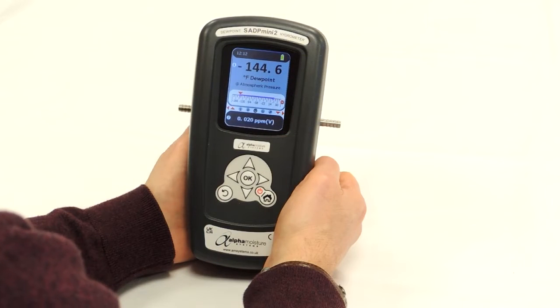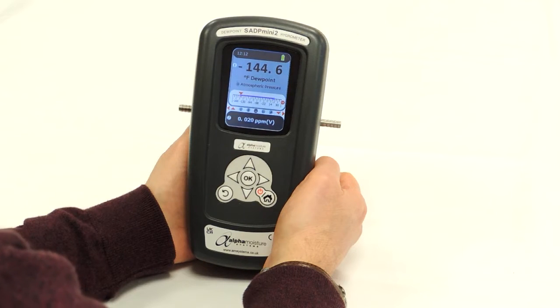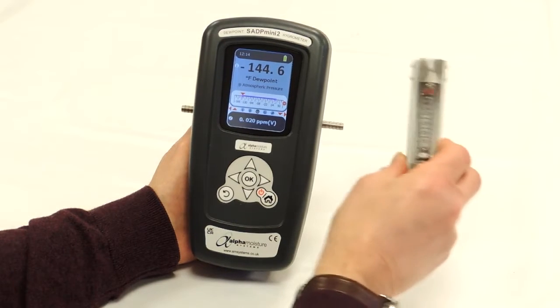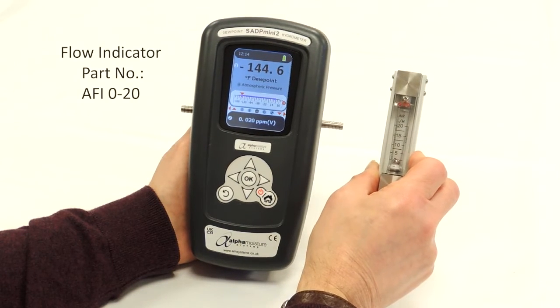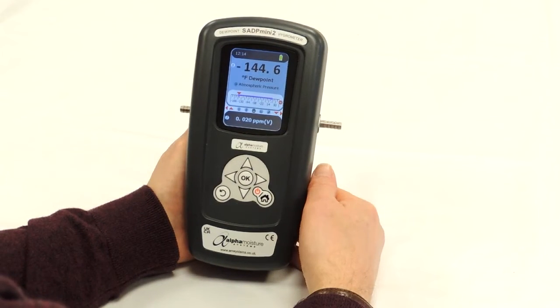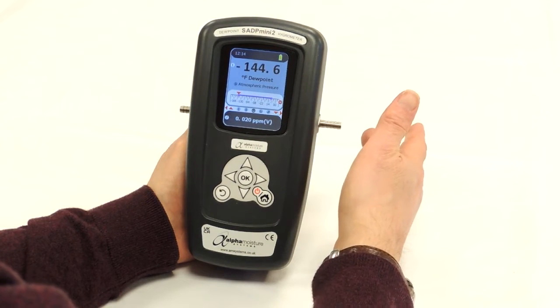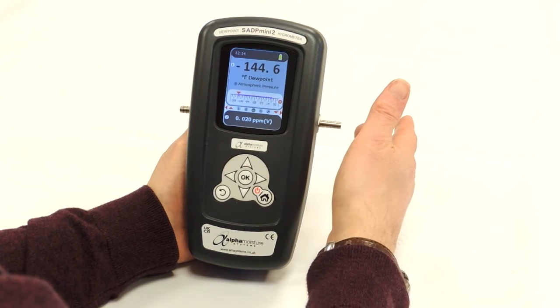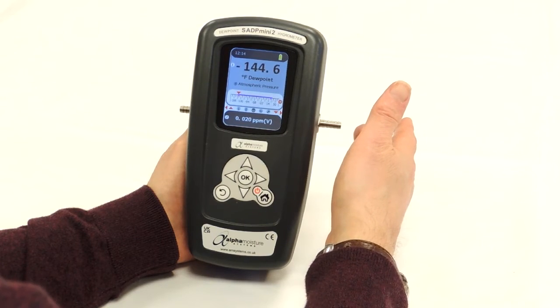When sampling, we recommend a flow rate of sample gas to the instrument of between 5 to 15 litres per minute, with a maximum of 20 litres per minute. One way of measuring the sample flow rate is to use a flow indicator such as this on the outlet of the instrument. In this example, the flow indicator has a range of 0 to 20 litres per minute. Alternatively, if no flow indicator is available, then you can hold your finger at the outlet pipe and judge the flow rate by feeling the flow of gas or air on the skin.